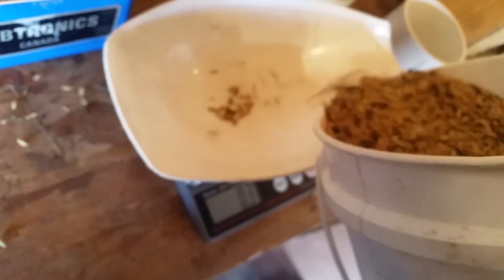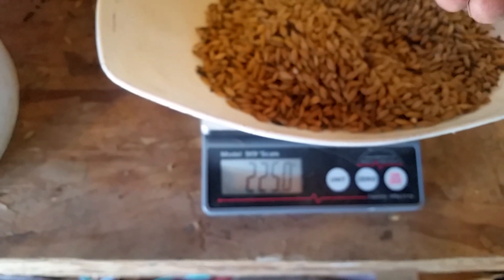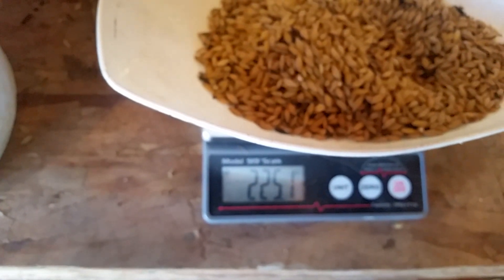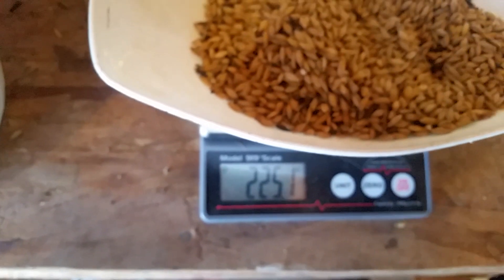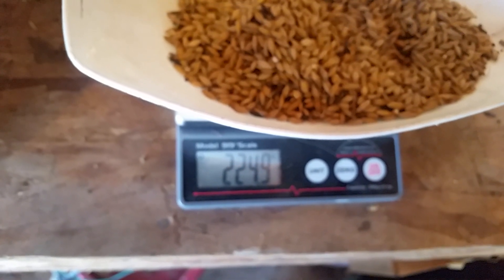Now that it's reading zero, put the container on — it usually weighs 128 grams. Zero it, then you take the grain and put in 225 grams. There's 240 grams — that's too much. Take one more seed out: one, two, three, four, five seeds removed. Right there — now we've got 225 grams.